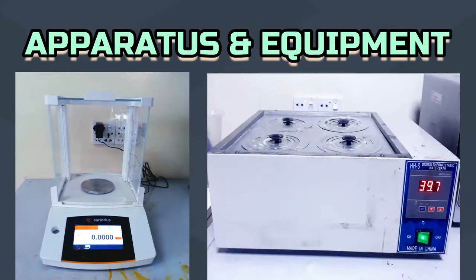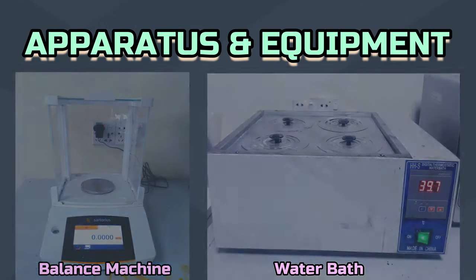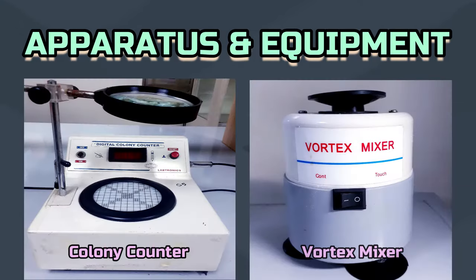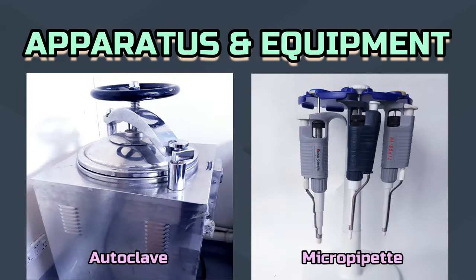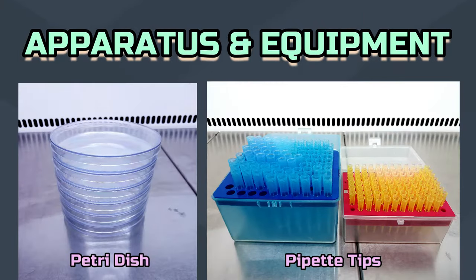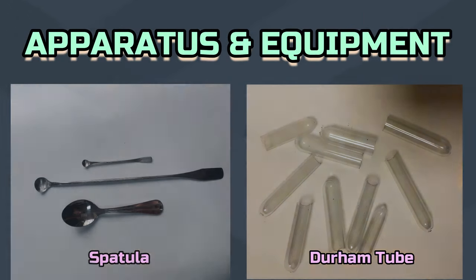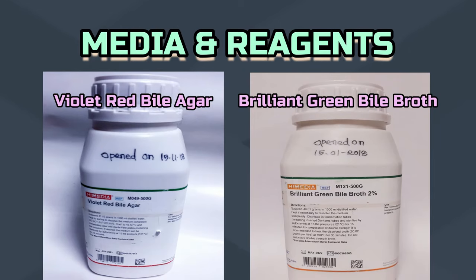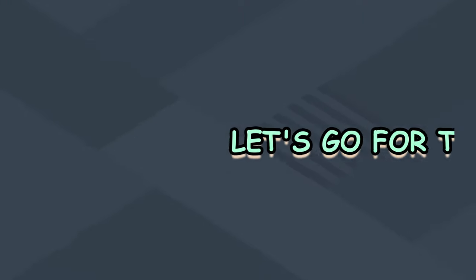For coliform count, we need some apparatus and equipment such as a balance machine, water bath, biological safety cabinet, incubator, colony counter, vortex mixer, autoclave, micropipette, sterile petri dish, pipette tips, spatula, Durham tube. We also need culture media such as violet red bile agar and brilliant green bile broth. Let's start the analysis.